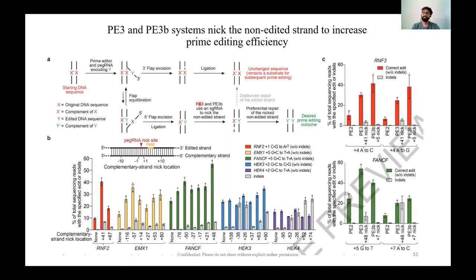So then you will need not just the PEG RNA version, but also a Cas9 nicking version, a single guide RNA nick that nicks around 40 to 50 base pairs from your actual PAM site. What this does is create a loop such that this reaction can actually take place. So you really have to use another guide RNA for the nick.